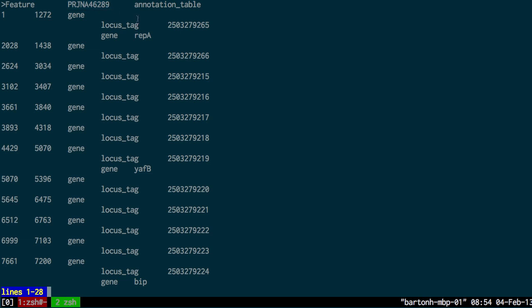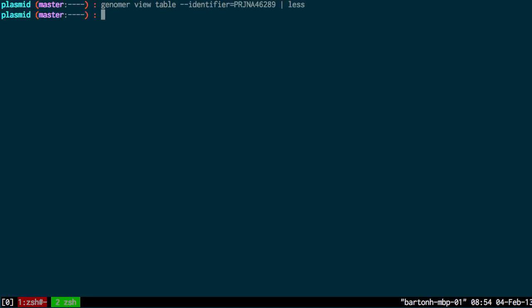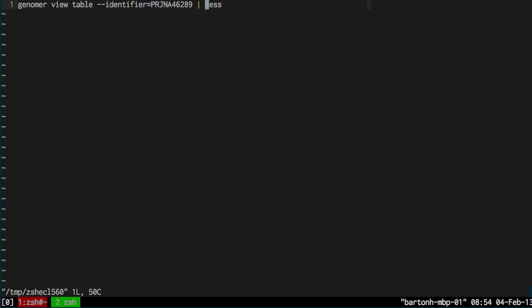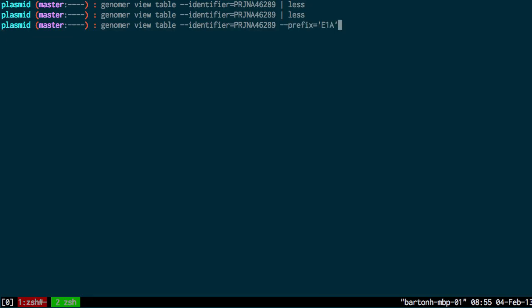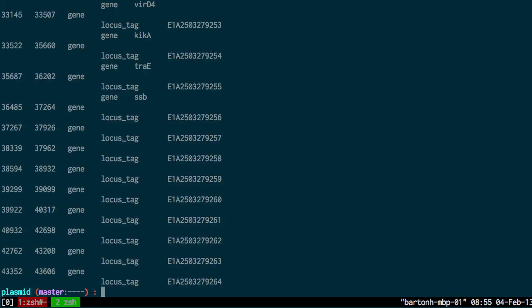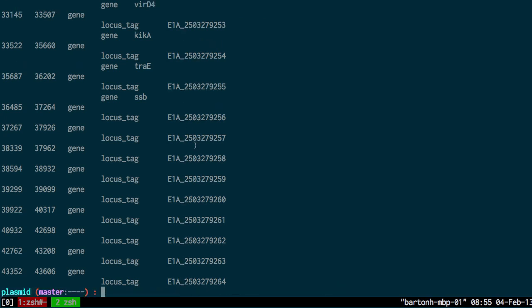However, I still need to also add a prefix to these annotations. When you submit a sequence to GenBank they require that you prefix your annotations. I can do that now by specifying the prefix here. My prefix for this sequence is E1A. So if I run that command now, you can see, actually I should add an underscore there. E1A has been added to the ID of these annotations.